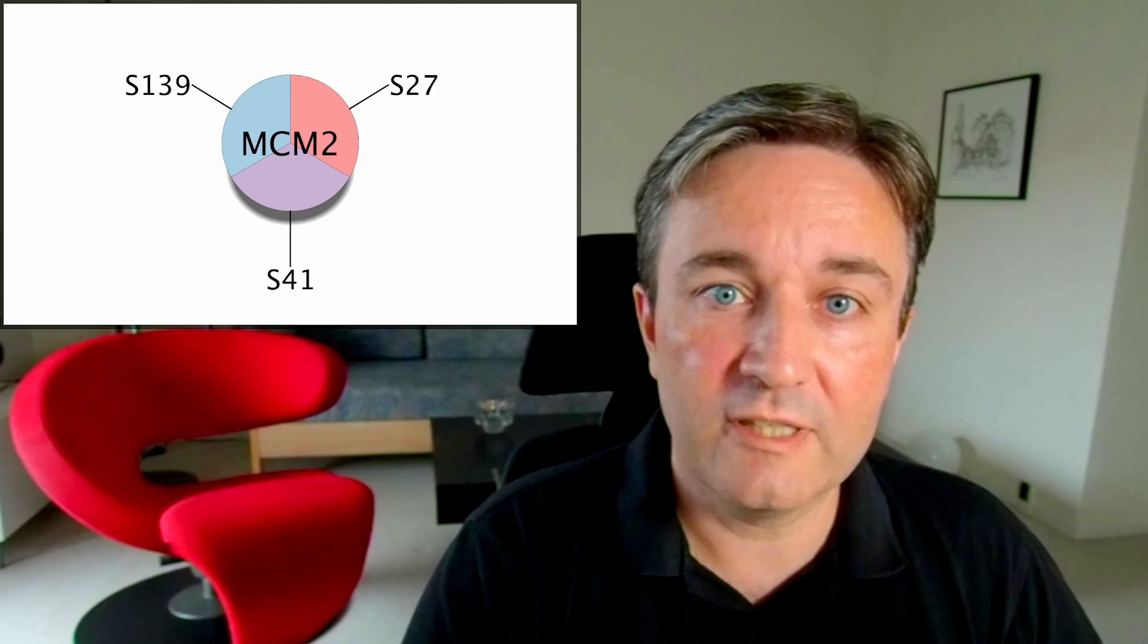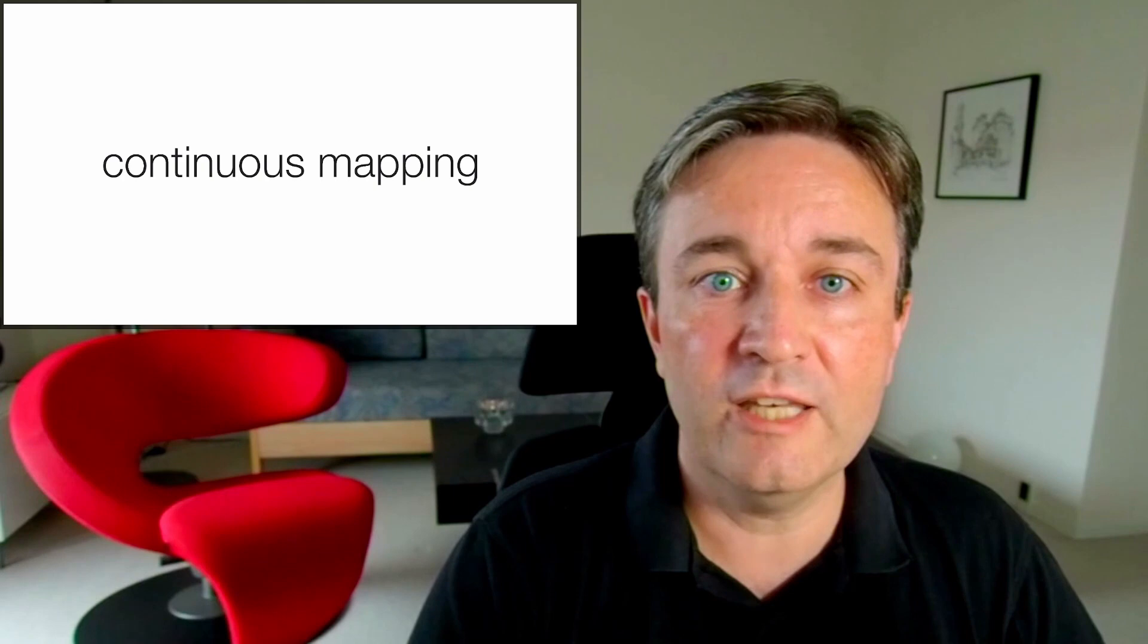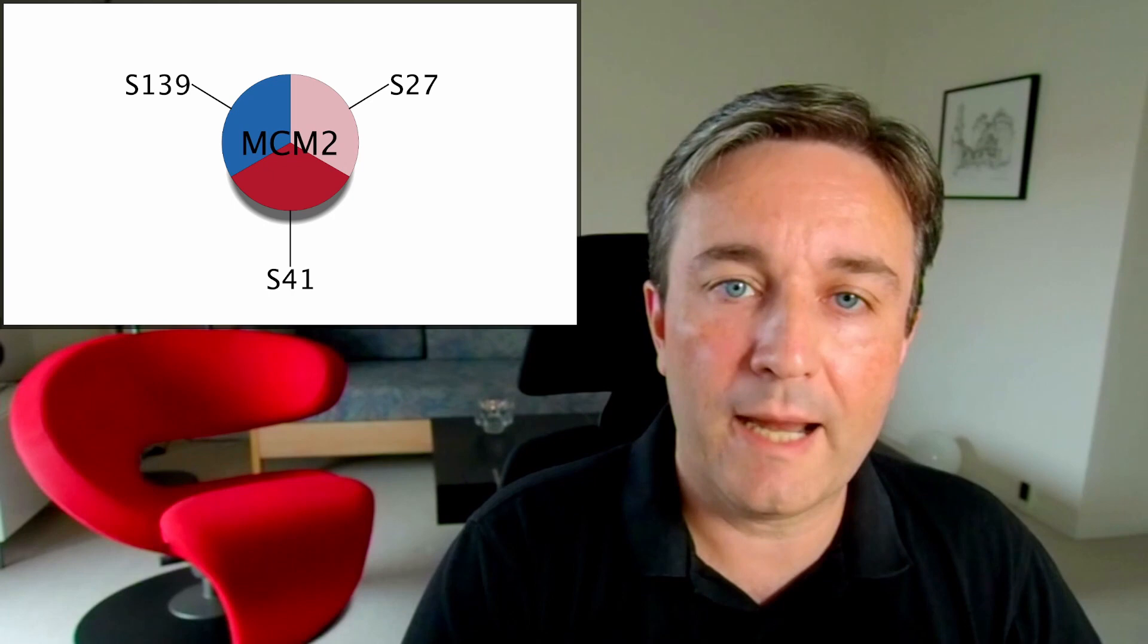Similarly, you can use continuous mappings to represent quantitative data, like log fold change values, to map the data onto the nodes.